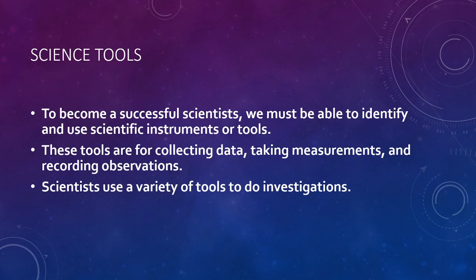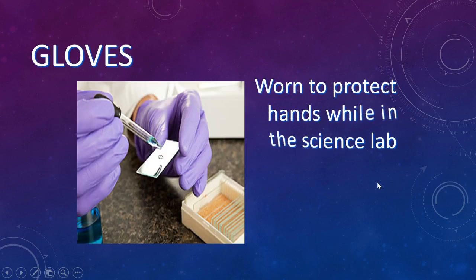So some of our safety equipment: the first one is gloves. These are worn to protect your hands while in the science lab. You would use these if you're doing a dissection or working with really dangerous chemicals that could harm your skin.